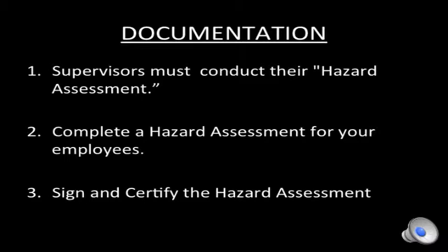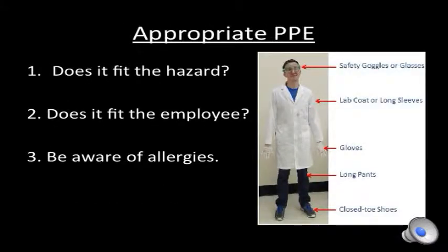Laboratory supervisors must document that they have completed a hazard assessment of their work area using LCC's Hazard Assessment Tool. Laboratory supervisors must also complete a hazard assessment for any employees that work in their laboratory, also using LCC's Hazard Assessment Tool. All hazard assessments must also be certified by a laboratory supervisor's signature. All hazard assessment forms will be reviewed and maintained by LCC's Environmental Health and Safety Manager.